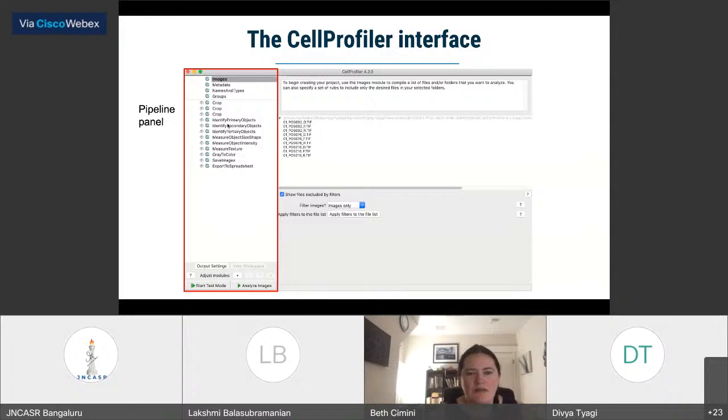So what this means is that we are creating essentially not just an image analysis, but a whole image analysis workflow. And we can create these workflows just by dragging and dropping different modules in our interface here and rearranging them so that our workflow can be applied reproducibly to any image. You can also save this as a text file and send it to somebody else, or attach it as supplemental material on a manuscript. And again, the pipeline will say what version of CellProfiler made it. And so the way to actually validate any analysis that you do is built right into the file.